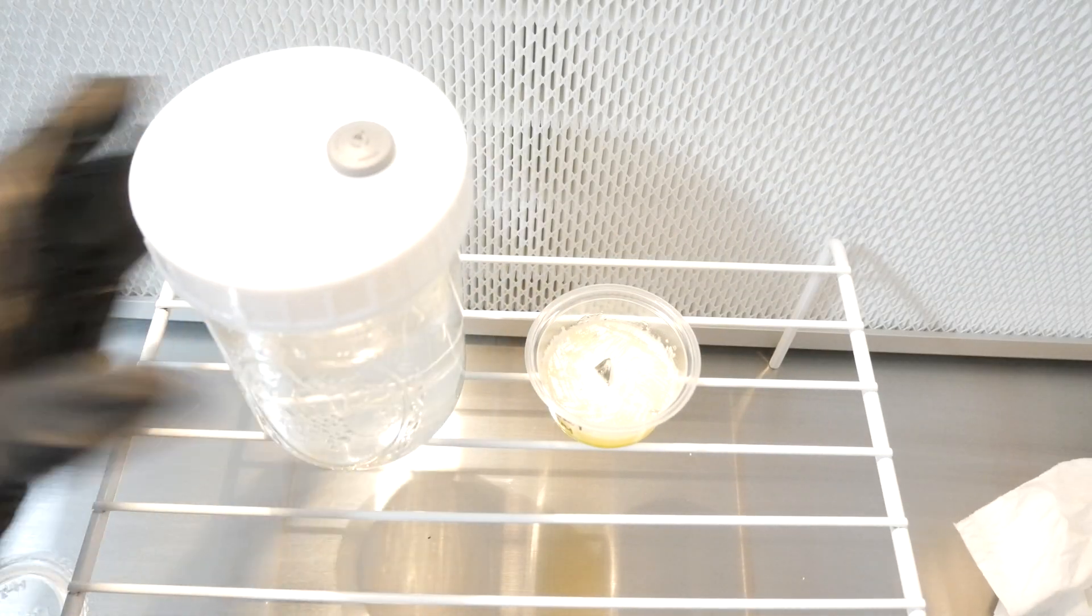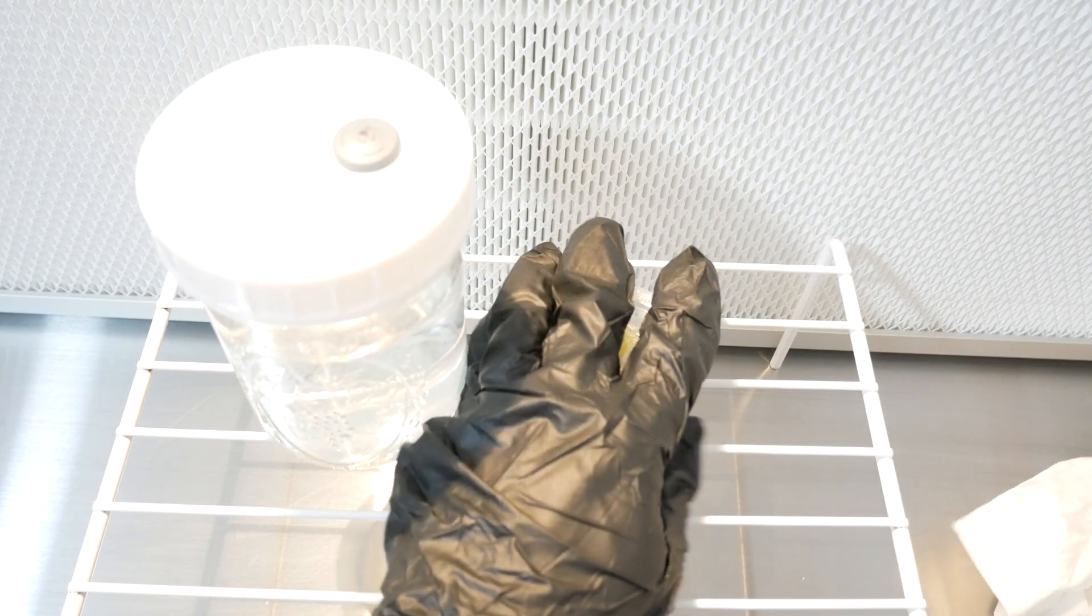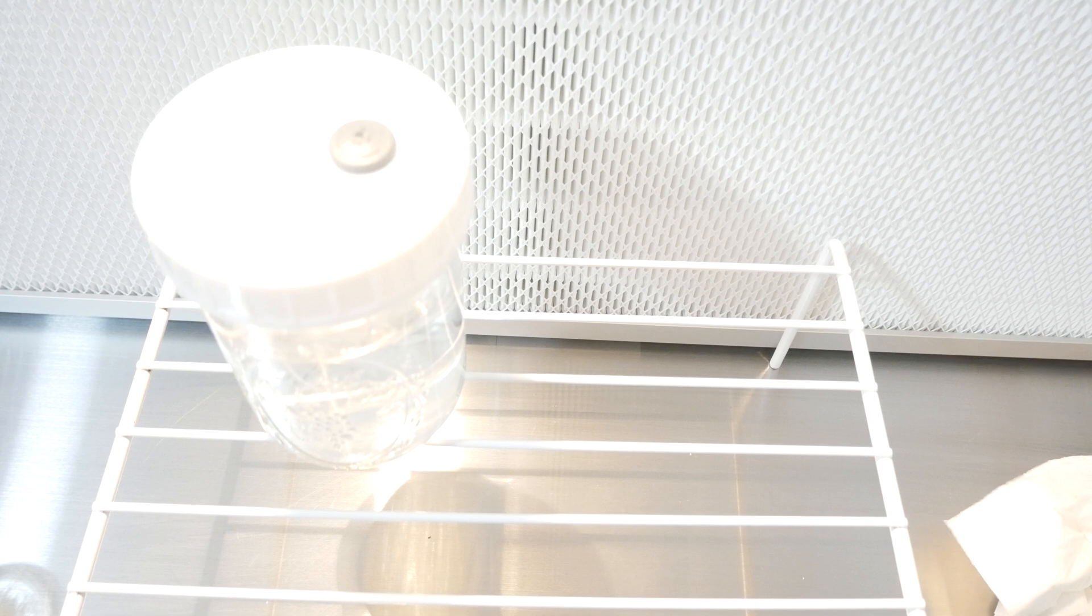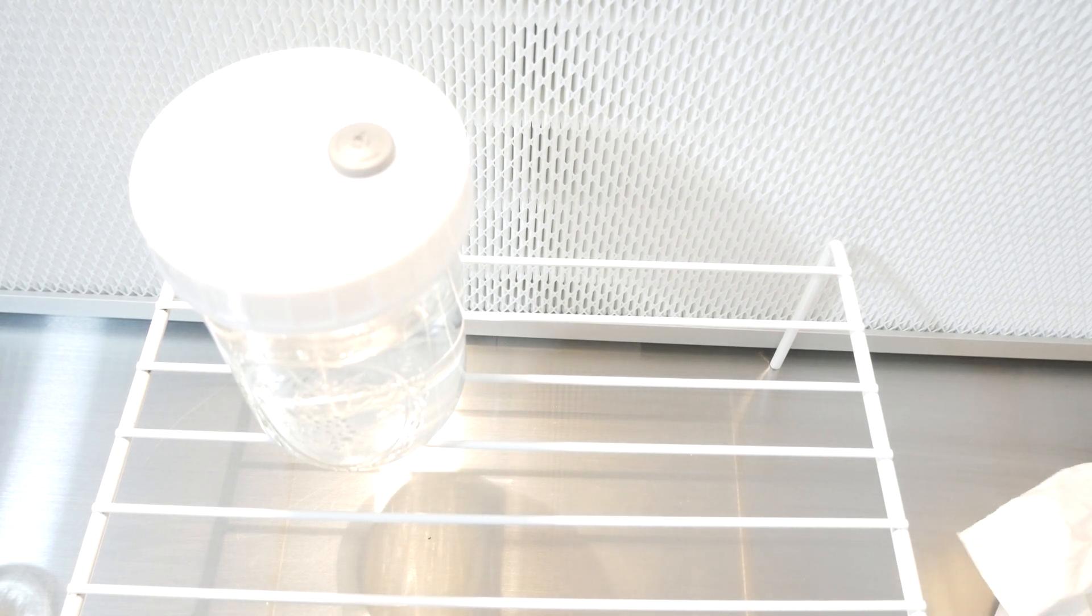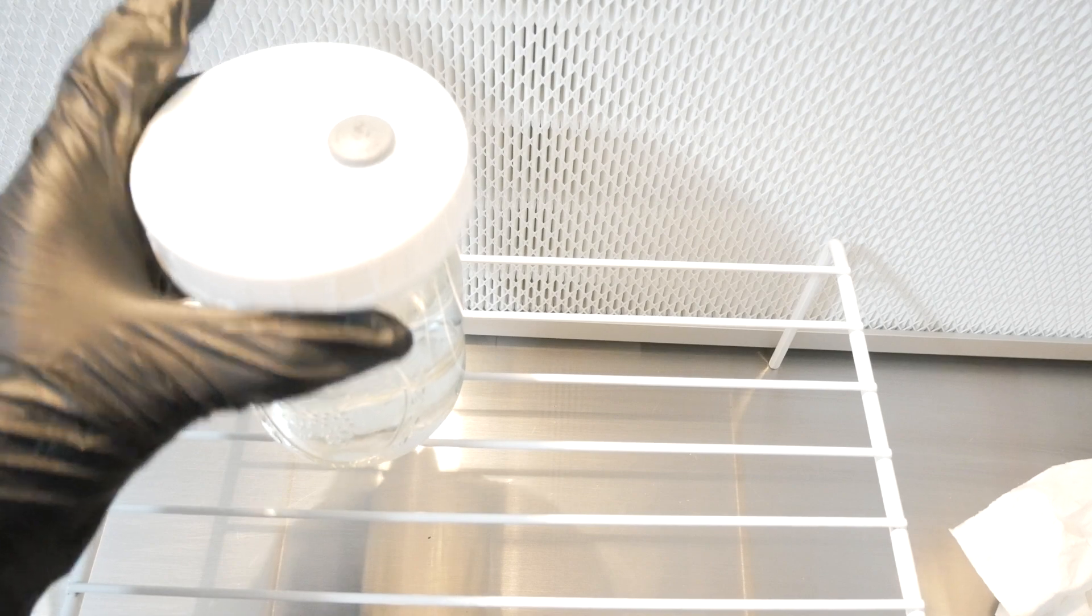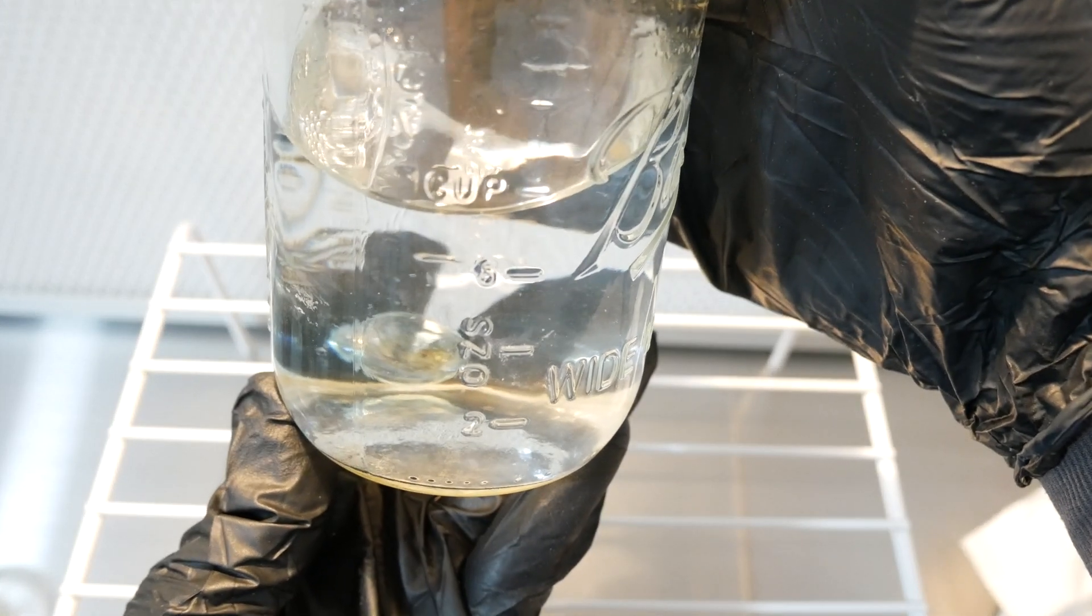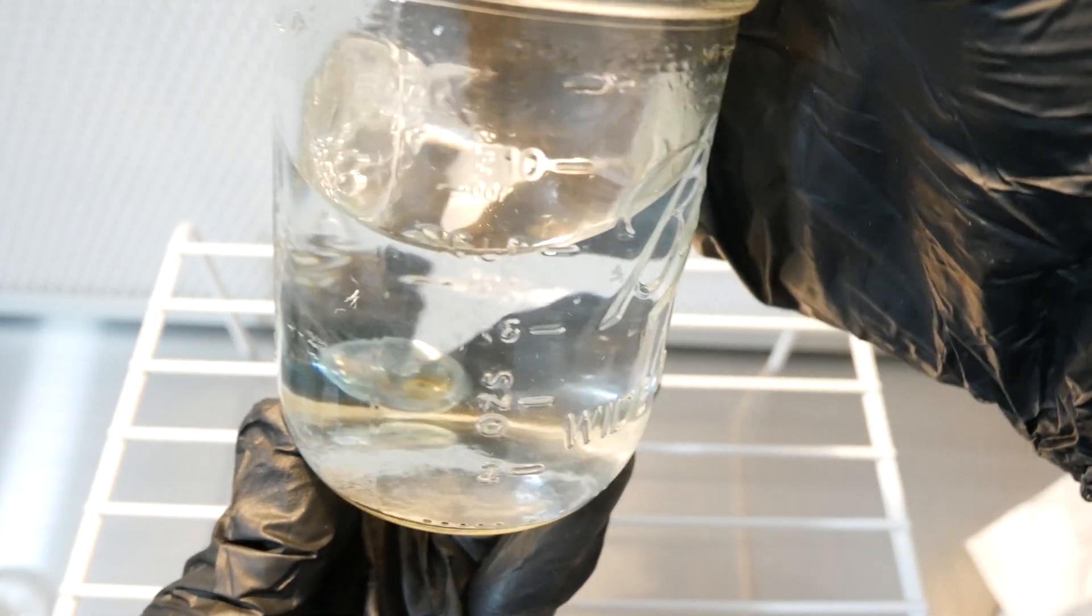So now that we have mycelium inside of the liquid culture solution, it's going to go ahead and colonize inside here and grow as it feeds off of the nutrients that's inside of the solution. After you have everything injected, you pretty much just want to go ahead and label your jars. I'm giving it a little quick swirl here just to kind of show you guys that there is mycelium inside of the jar here. And over time this mycelium is going to feed off of the nutrients that's inside of the liquid culture and it's going to grow and expand.